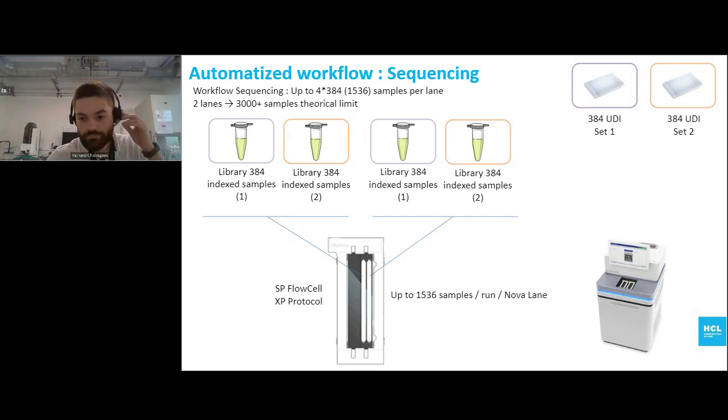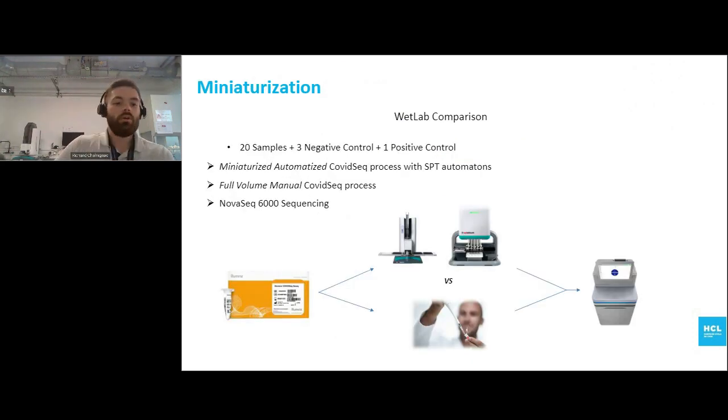All right, thank you, Quentin. For the miniaturization part, we did a simple experiment to compare the results from the automatized and the manual process.